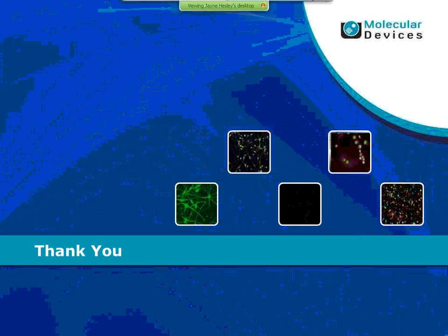There's a question here: do we ever test accuracy of the neuron outgrowth with the various staining, beta-tubulin staining or bright field, or even calcein AM?